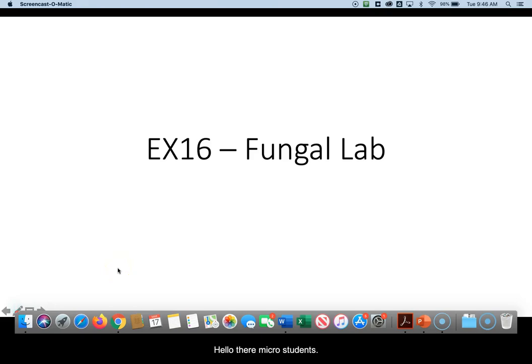Hello there, micro students. This is the first lab that we get to try to do online. So the plan is to make some videos to try to capture what you would have missed, or what you are going to miss because you're not able to attend lab.